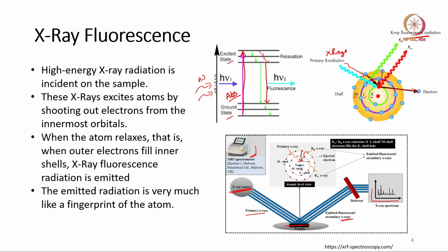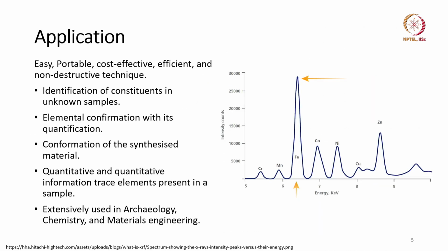So, it is the model of Malvern Panalytical. It is the company that makes the X-ray fluorescence instrument. So, this is the basic phenomenon, and based on this we can use it in several kinds of applications. We will talk about some of the applications.